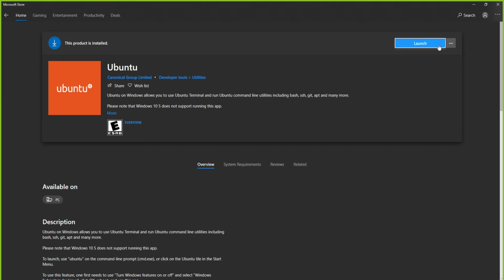And for you, it should say install. I assume I'll need to do the same thing after the changes are applied here. Exactly. Exact same thing. And so, yeah, I guess we kind of have it fairly easy. So you just press this button, launch after downloads and installs.